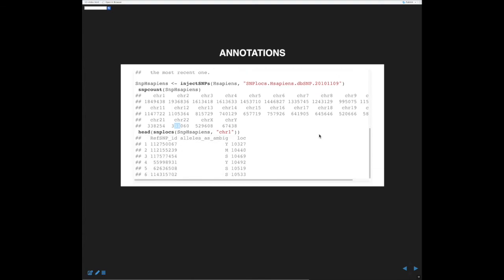Okay, and you can start to dig in as to what those individual polymorphisms are. Are they in genes? Are they in introns? Are they in wastelands that have no coding potential whatsoever? If they're in an exon, do they change the amino acid? Are they non-synonymous?